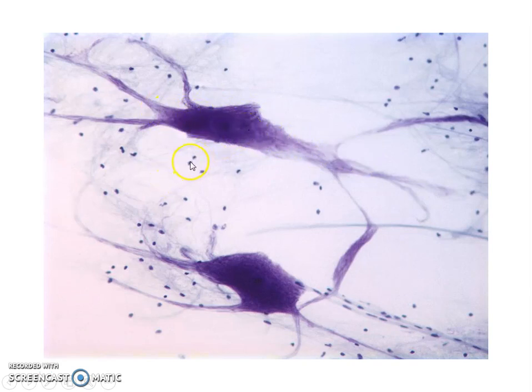In addition, we're going to have these other tiny little cells that are going to be surrounding the neurons. These are called neuroglial cells. But for this test, for test number 1, just be able to recognize this as a neuron and the tissue as nervous tissue.